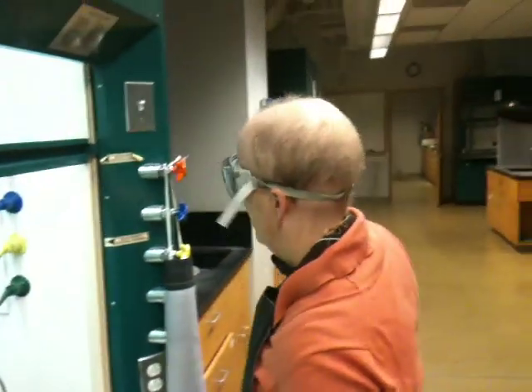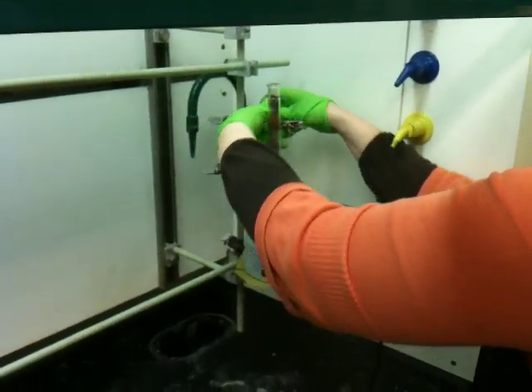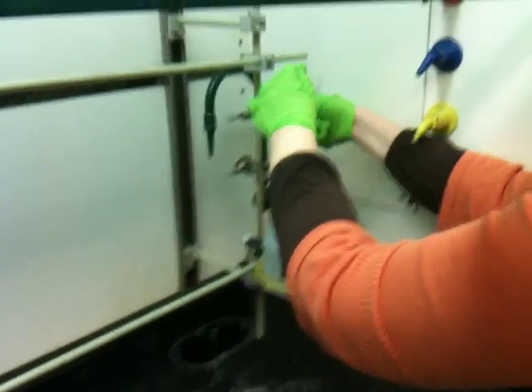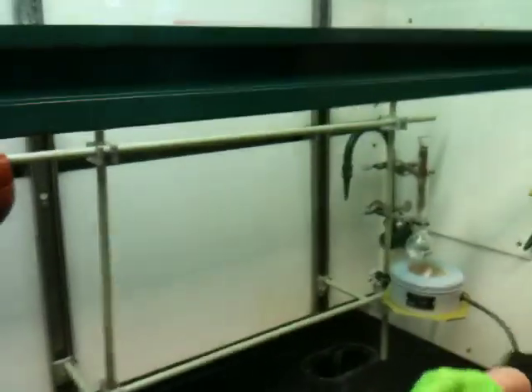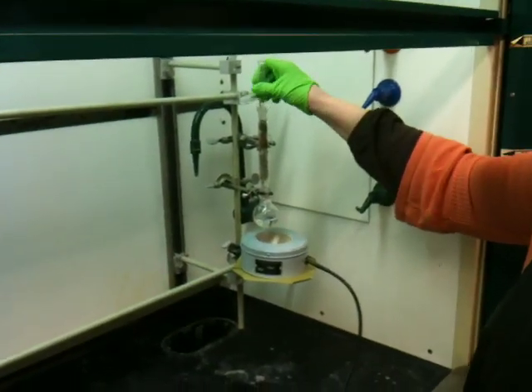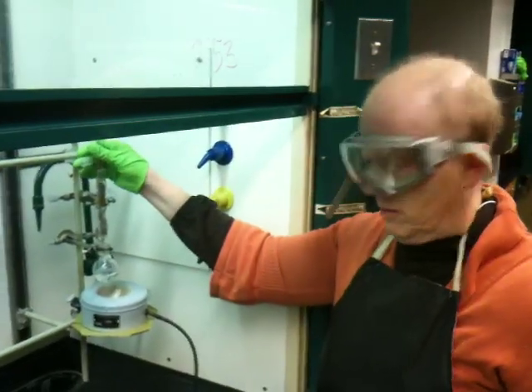Grease is not glue — grease is just grease, so it won't hold it together. What you need is another clamp. You want all your joints to be flush. Then I'm going to put a still head on. Again, I'm putting a new joint in, so I put a little tiny bit of grease on it, insert it in the joint, and twirl it around so that it gets spread out and seals the joint. It keeps the vapor from coming out of the joint.